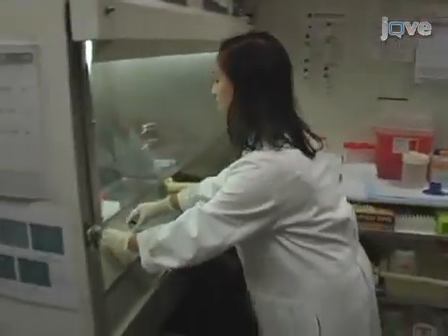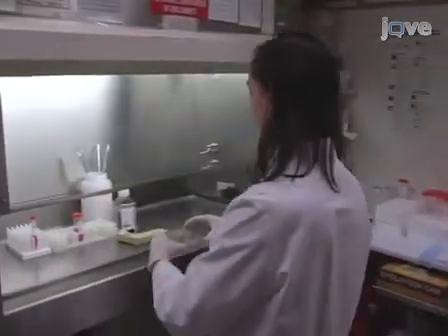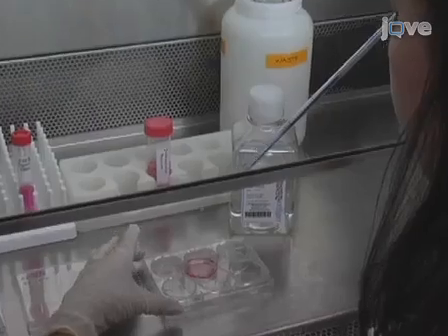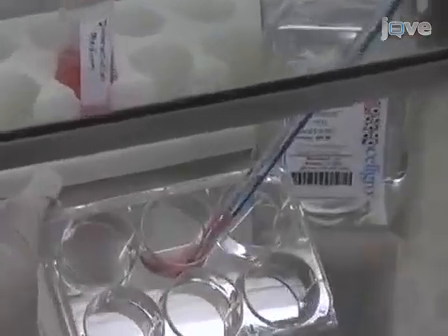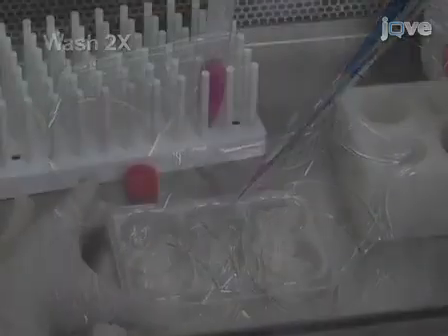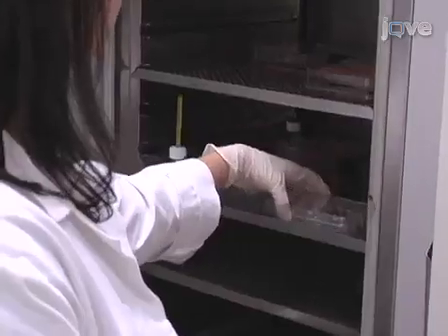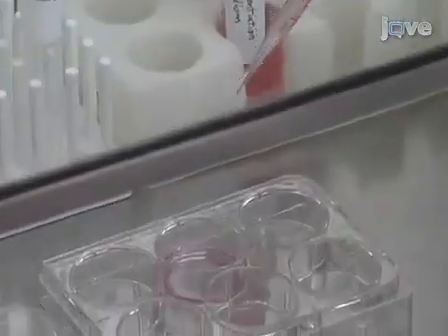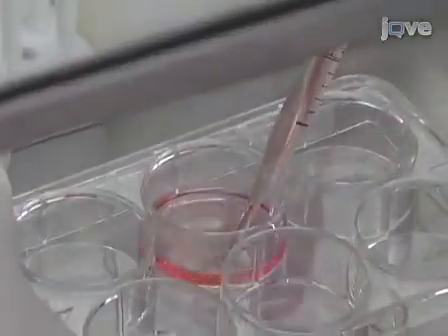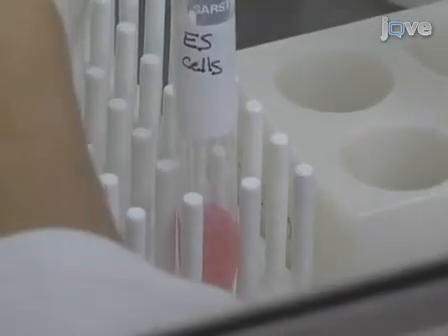On the day the co-culture experiment begins, the OP9 cells that were subcultured 3 days ago should be confluent. The ES cells should be cultured according to the standard protocol for your particular cell line. Wash ES cells 2 times with PBS. Trypsinize with 0.25% trypsin EDTA and incubate for 5 minutes at 37 degrees Celsius. Next, add co-culture differentiation media to the ES cells and transfer them to 15 ml conical tubes.